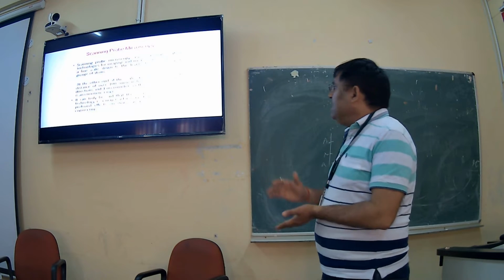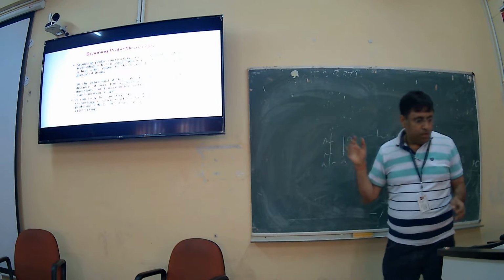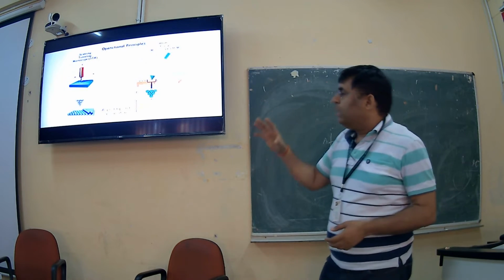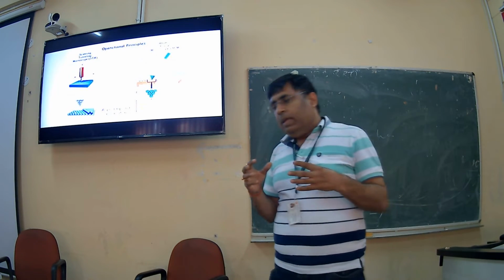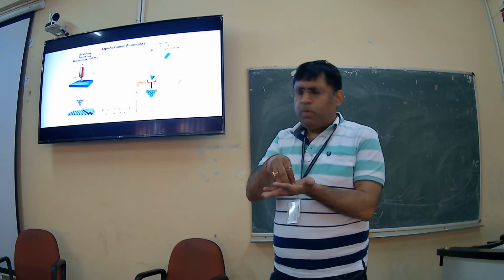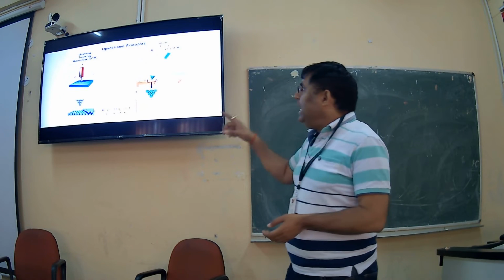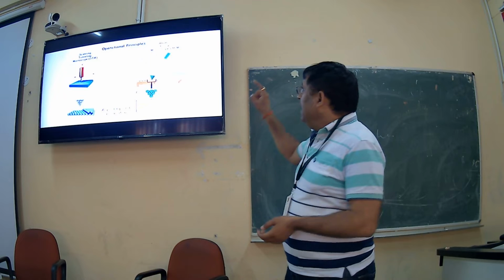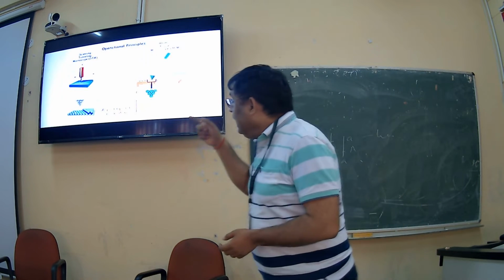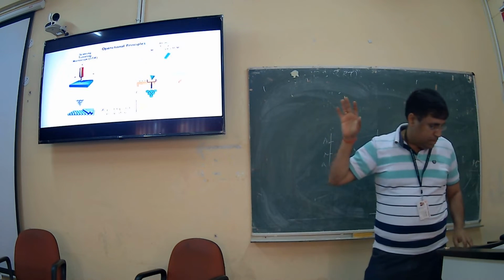It can truly be said that the development of this technology is a major achievement, having a profound effect in the area of science. Now I told you there are several names of scanning probe microscopy. Here we use the probe, and two popular examples I am going to tell you about: the scanning tunneling microscope, and second, the atomic force microscope. Scanning tunneling microscope and atomic force microscope, that's what we are going to discuss today.